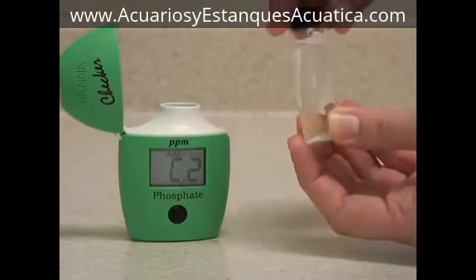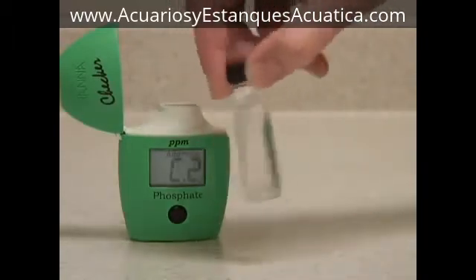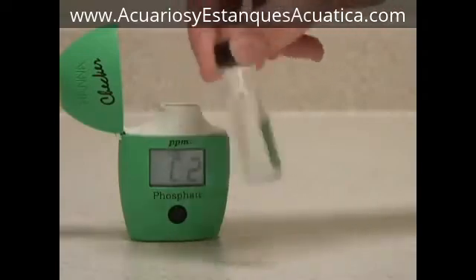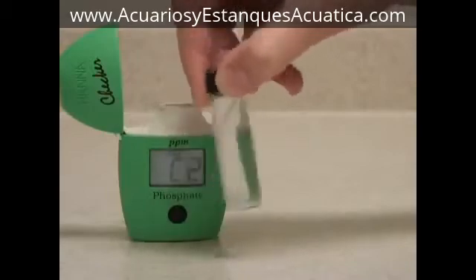Put the cap back on and shake gently to dissolve the sample. You want to try and avoid shaking it too vigorously. Shaking it too much can introduce micro-bubbles that will alter your reading as well.